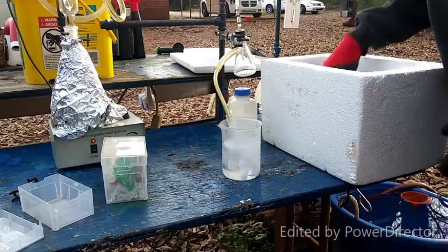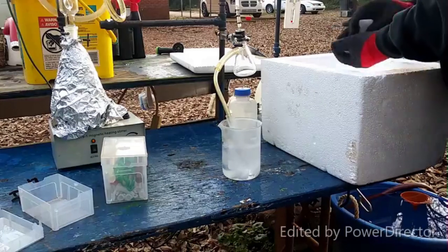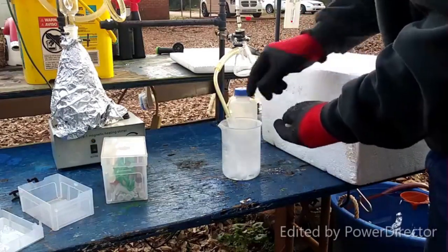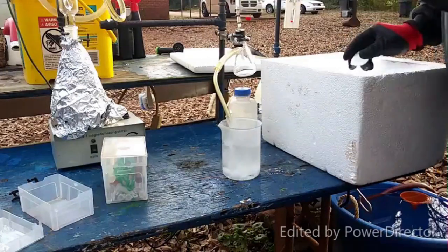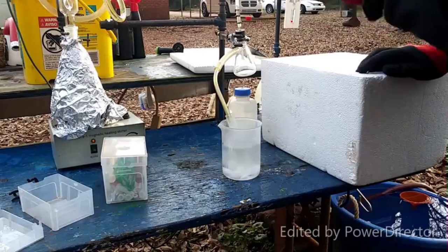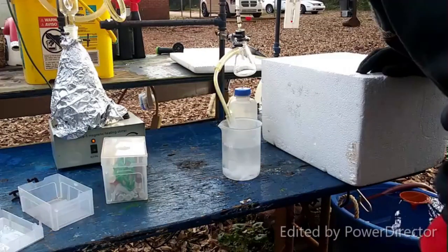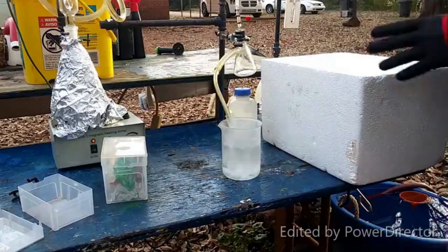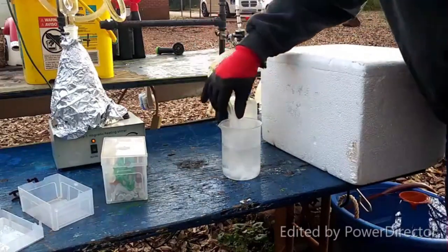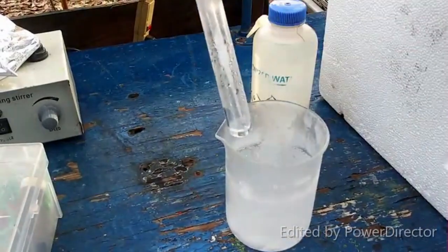The dry ice disappears fast — it never really does that in water. I know, that's why it surprised me. This is my first time doing this too, I'm a little surprised myself. But hey, that's how we roll on this channel — we try different things we've never done before and we try not to kill ourselves.